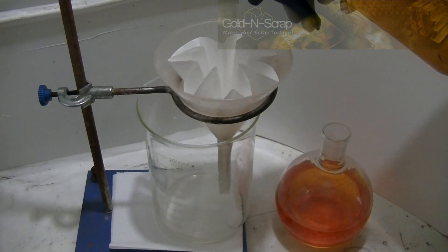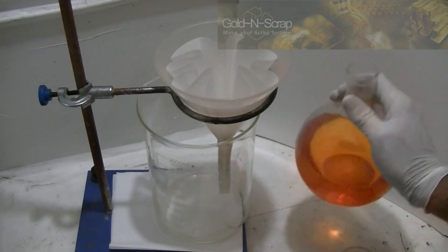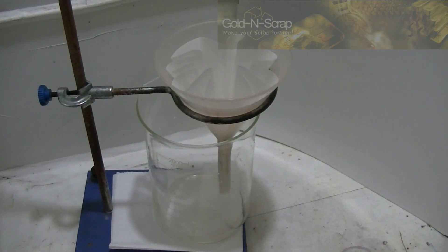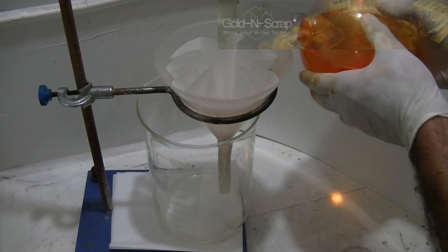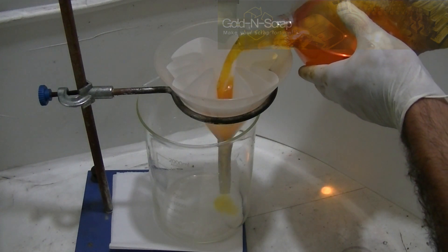The fluted filter paper sets in the funnel as soon as it gets wet. First, the bulk of the gold solution which is free and clear of solid particles is poured to the filter. This portion will run down very fast.